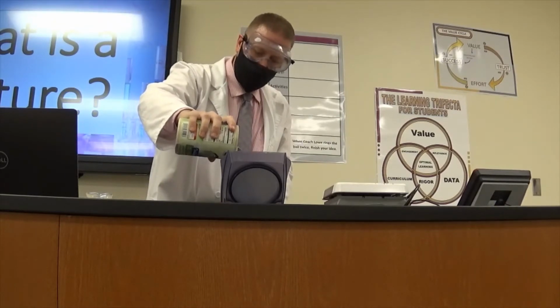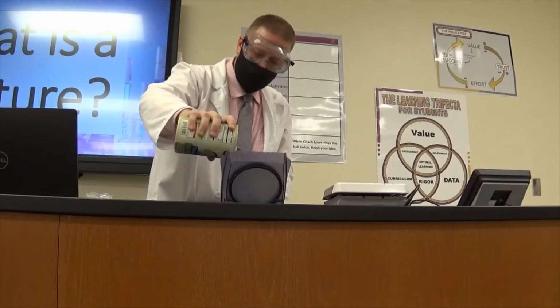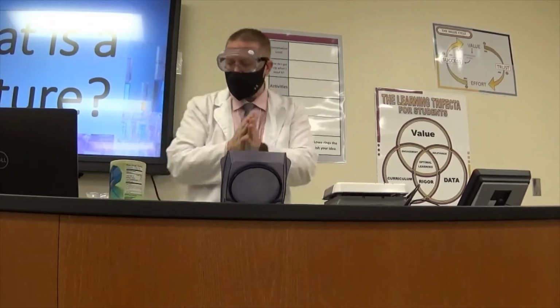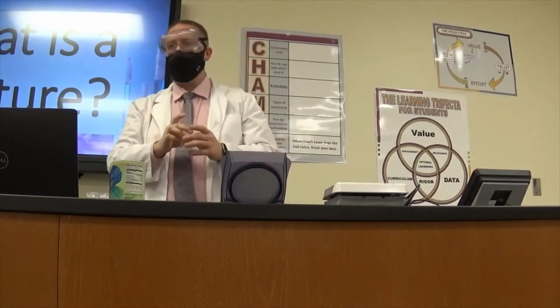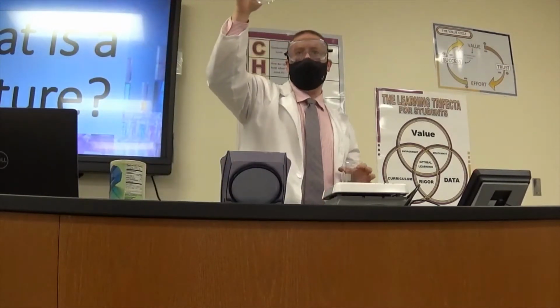So I'm looking for 114. Okay, 114.32. So I have the beaker, I have 3 grams of salt. In this beaker, I have 50 milliliters of water.